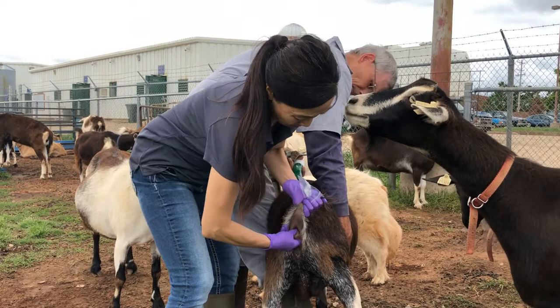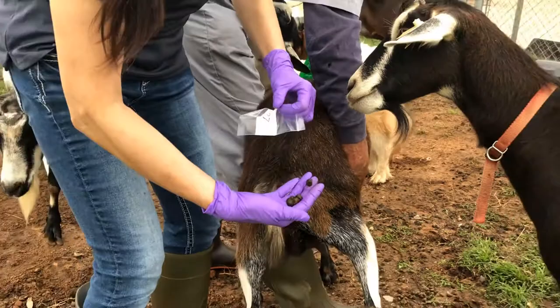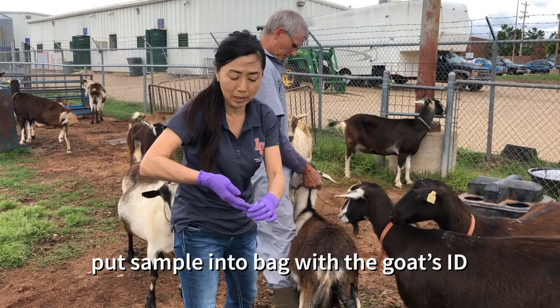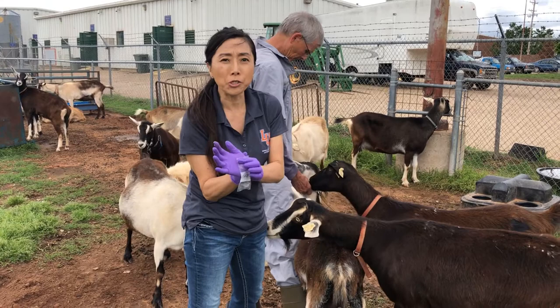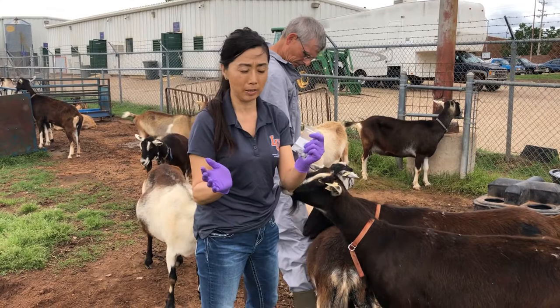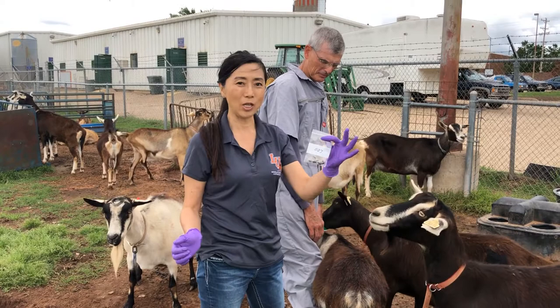Then you can collect the samples. After you collect the samples, you want to put the sample immediately in the bag, put the air out and seal it. Then you want to keep it in the ice chest until you conduct the egg count.